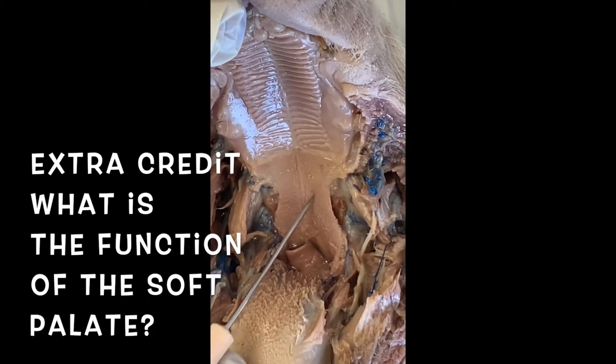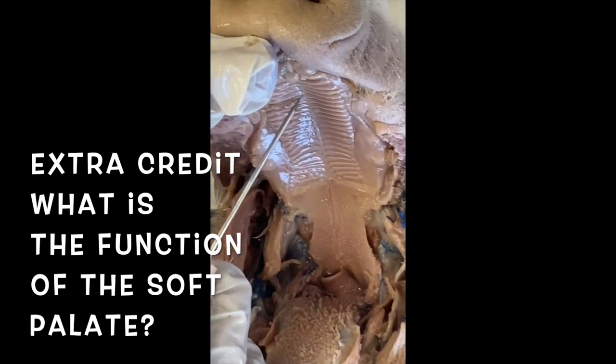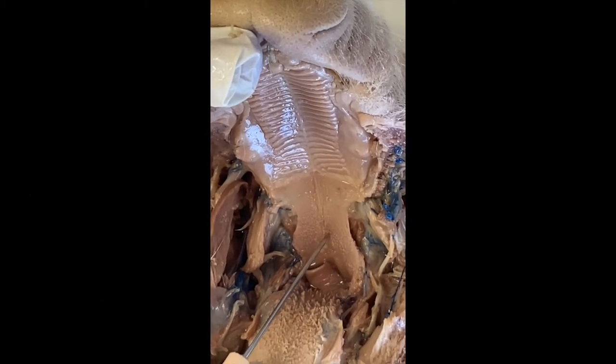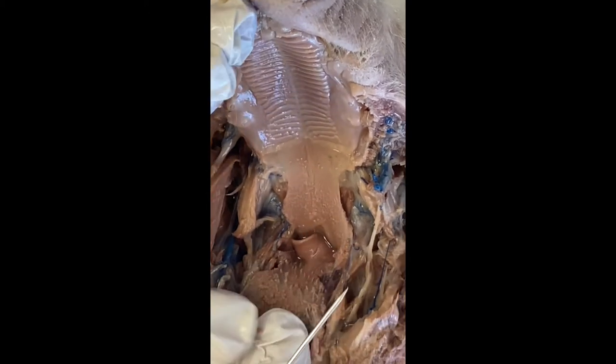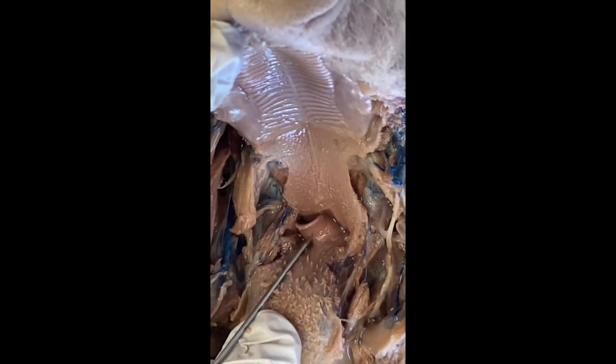I'm blanking on that for a moment, but I know there's a lot more with actually the throat. So it has more function, whereas this is just there in the roof of the mouth. So this has a little bit more movement due to its muscle structure. So soft palate, hard palate, and then the little flap to keep your food going down into your esophagus and not into your lungs is called the epiglottis. So it's that tiny flap.